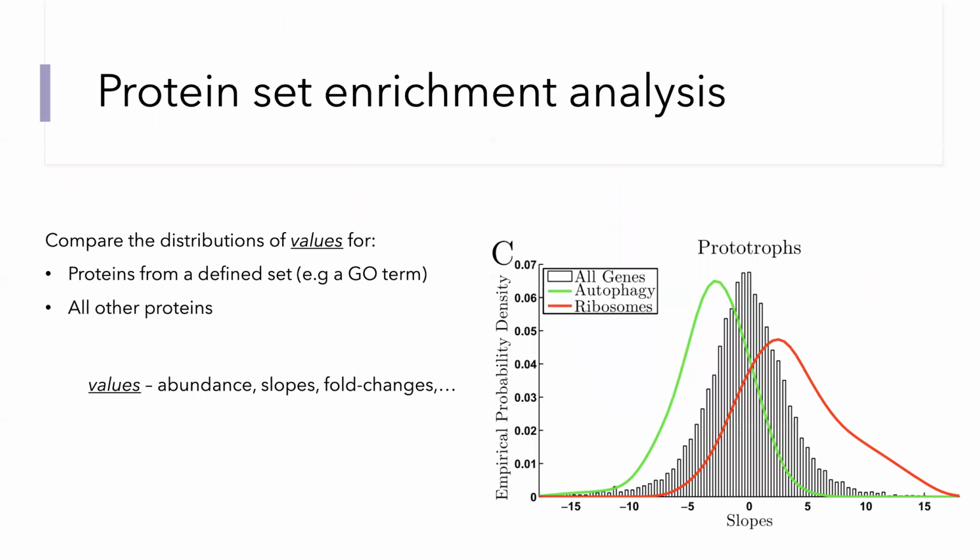And in fact, there are methods that can allow us to relax or sidestep the assumptions made in estimating differential protein abundance and give us confident inferences of functionally related sets of proteins that are changing across the studied sets of conditions. One set of approaches that can do this analysis is known as protein set enrichment analysis.